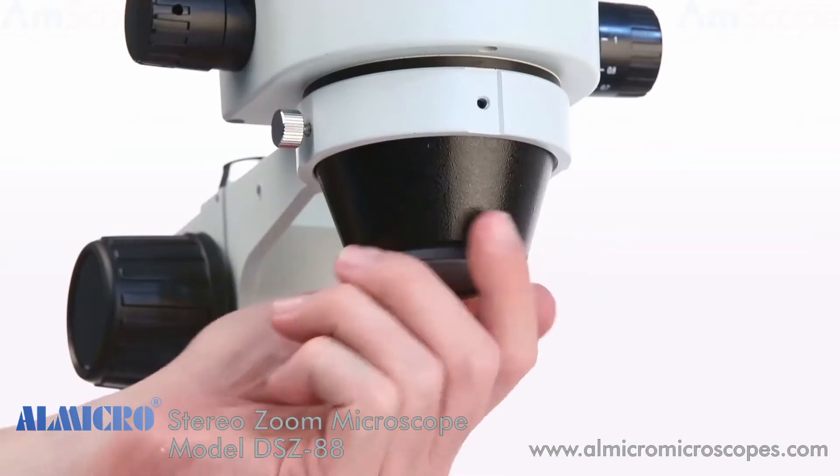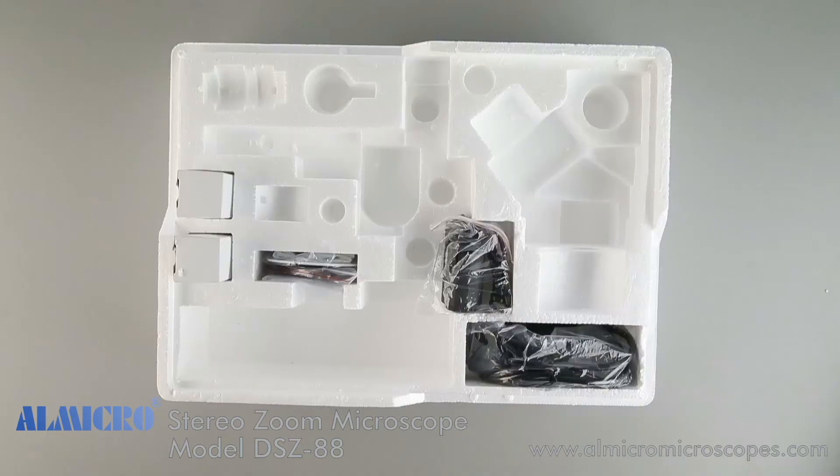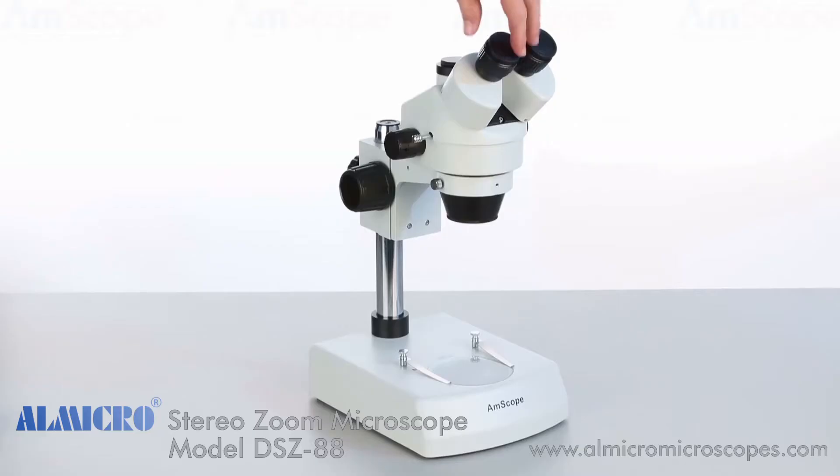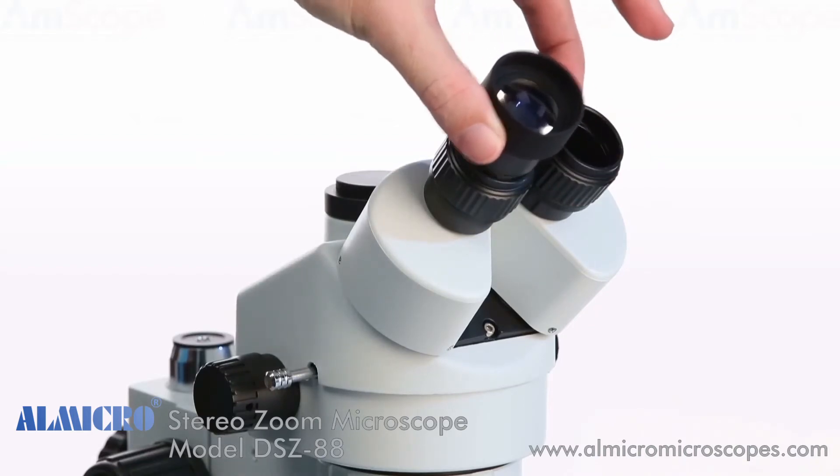Next we'll unscrew the lens cap to reveal the lenses. Now we'll move on to the eyepieces. Start by removing the dust caps on the eyepiece ports, then slip in each eyepiece.